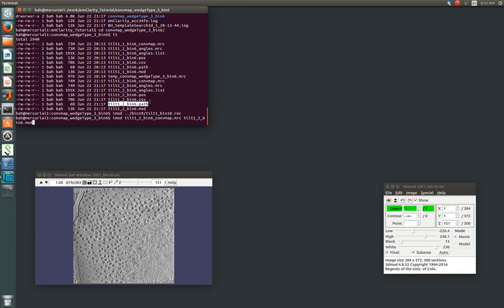The way you do that is before we initialize the subtomo meta file, we just delete this path file. And that's all you have to do.